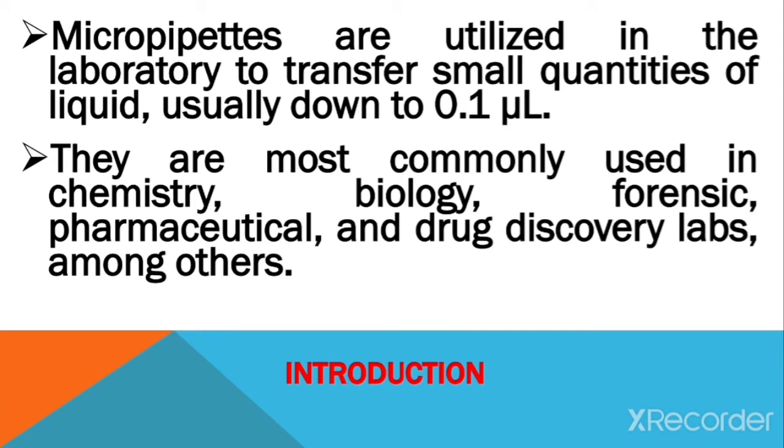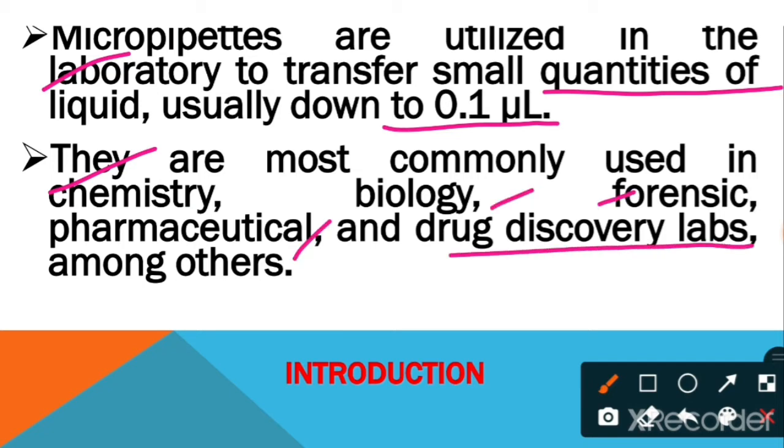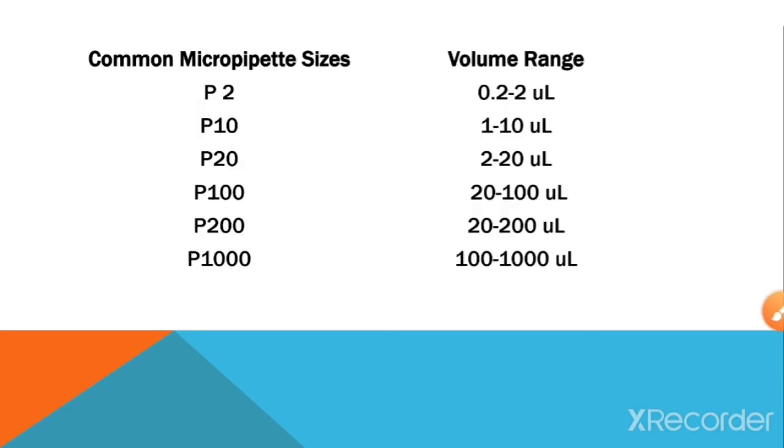Let's see the introduction of operation of micropipettes. Now micropipettes are utilized in the laboratory to transfer small quantities of liquid, usually down to 0.1 microliter. They are most commonly used in chemistry, biology, forensic, pharmaceutical and drug discovery labs among others.